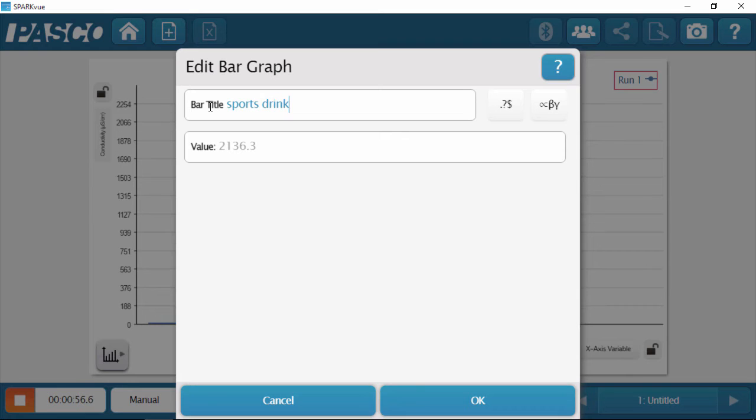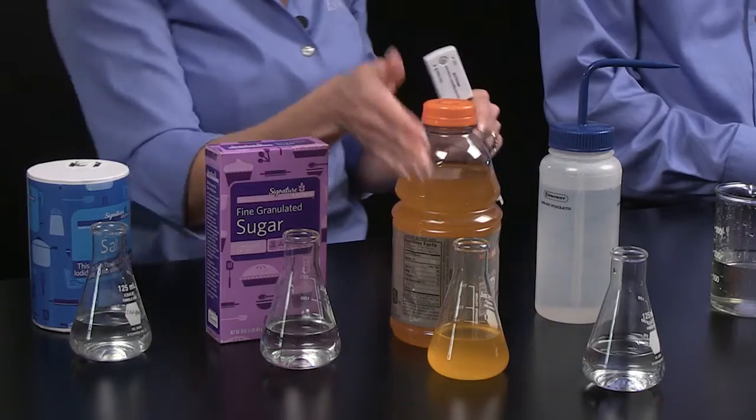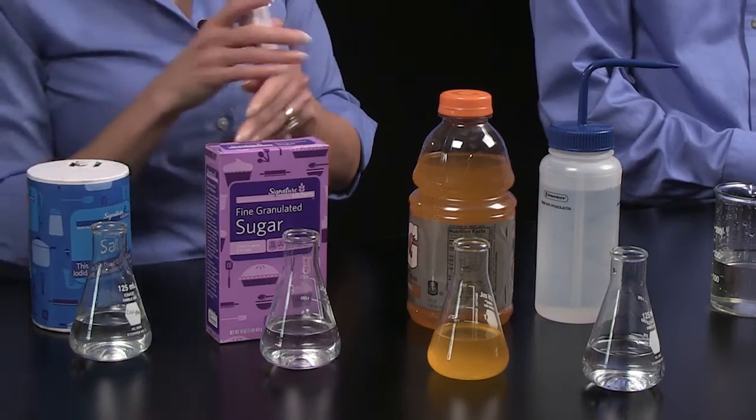While Tom renames that bar, I'm going to rinse the sensor and prepare it for the next sample. What I'm really curious about is what's causing the conductivity in this sports drink. If I look at the ingredients on the label, it says water, several different sugars, and several different salts. So what is causing the conductivity? We know it's not the water because water read a conductivity of zero — so it's either the sugar or the salt. I've got a sugar water solution here and a salt water solution here. Let's begin with the sugar water.